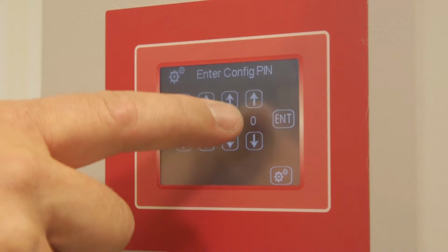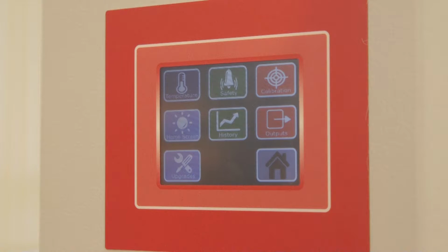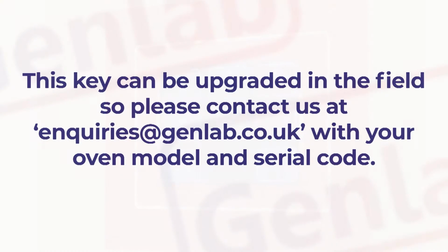If you press the configuration key and find there is no timer logo like this, you will need to contact your supplier to get a timer activation license key. This key can be upgraded in the field, so please contact us at enquiries@genlab.co.uk with your oven model and serial code.